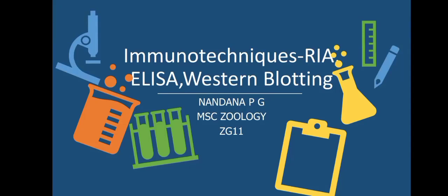Hi everyone, my seminar topic is immunotechniques. Immunotechniques are mainly used to determine the concentration of antigen or antibody in a sample. Here we are going to discuss three immunotechniques: RIA, ELISA, and Western blotting.